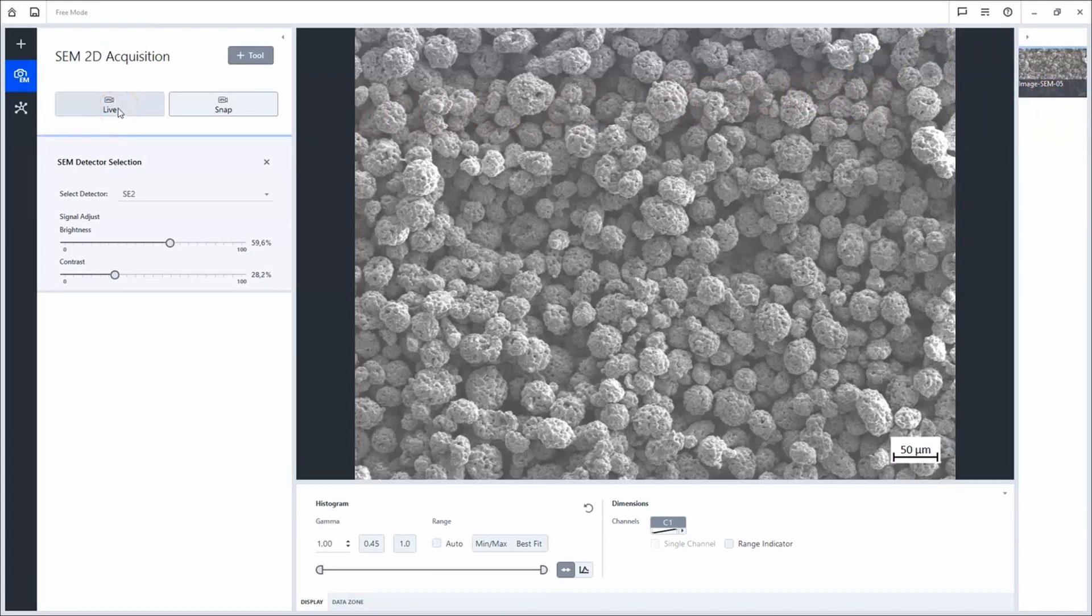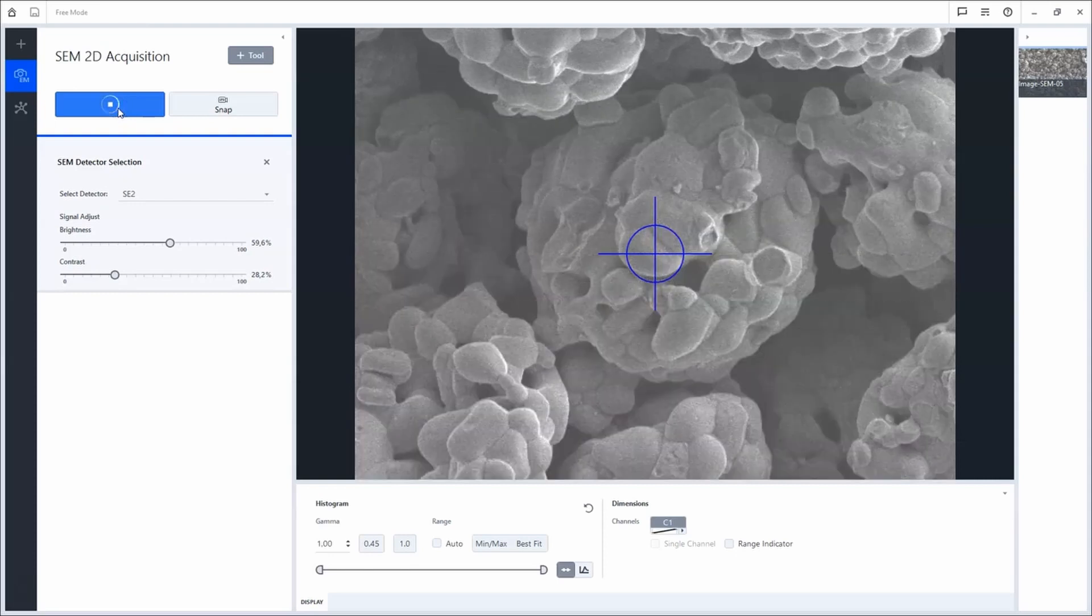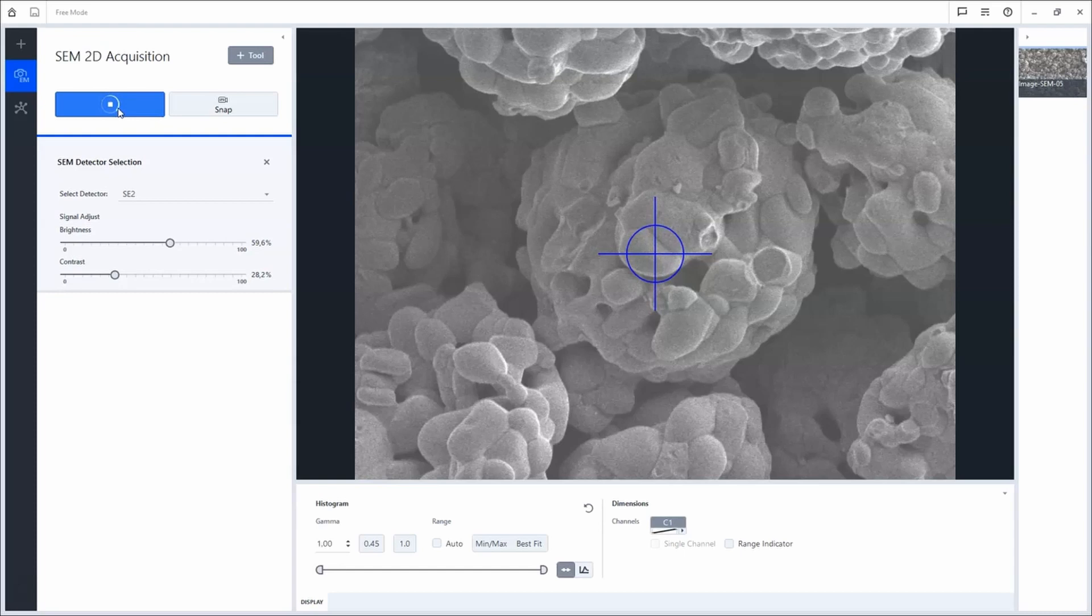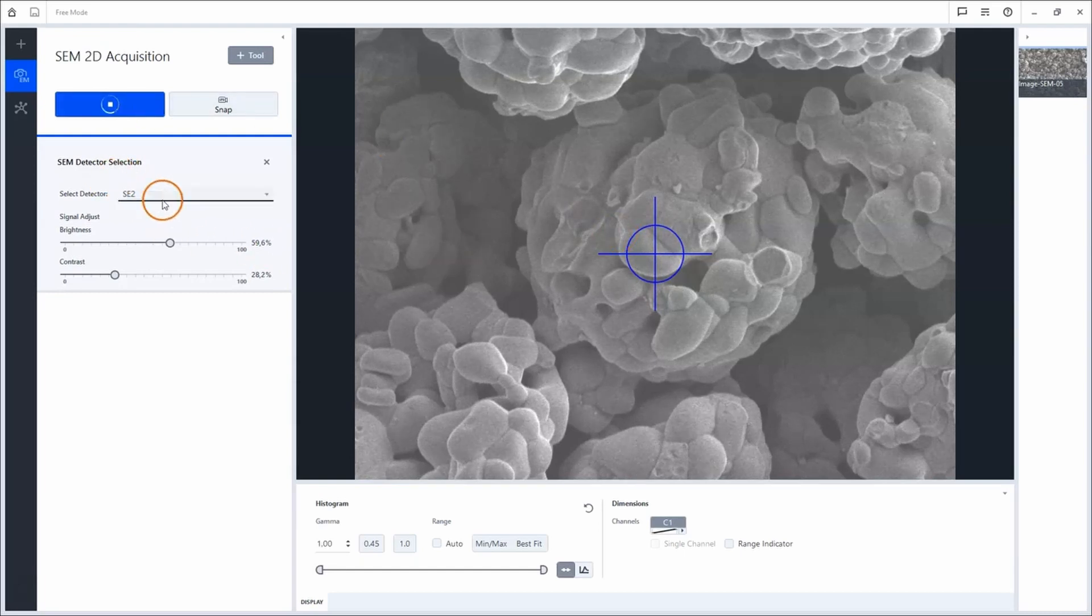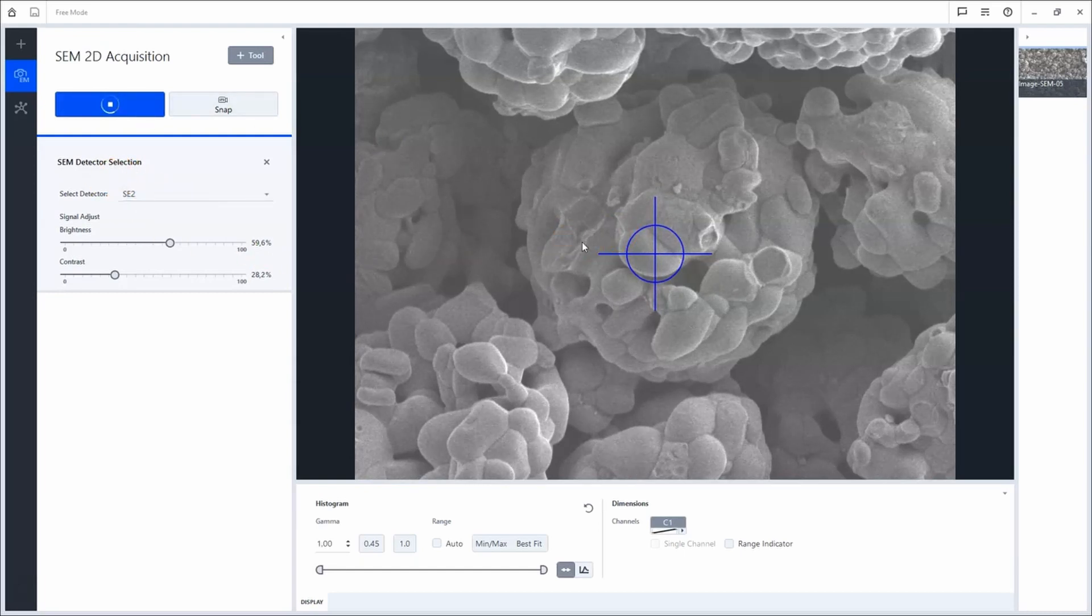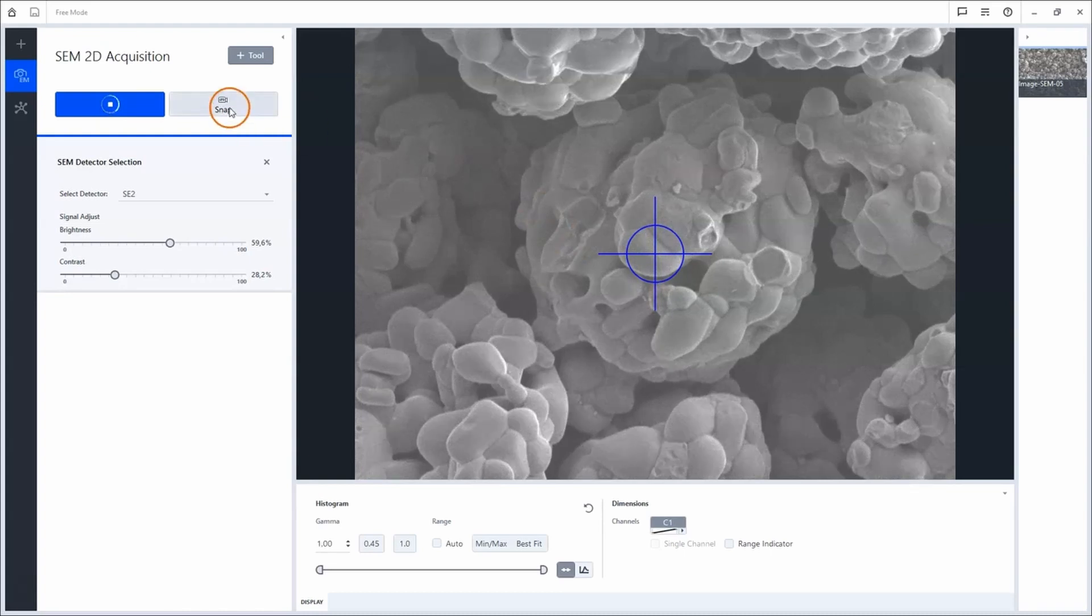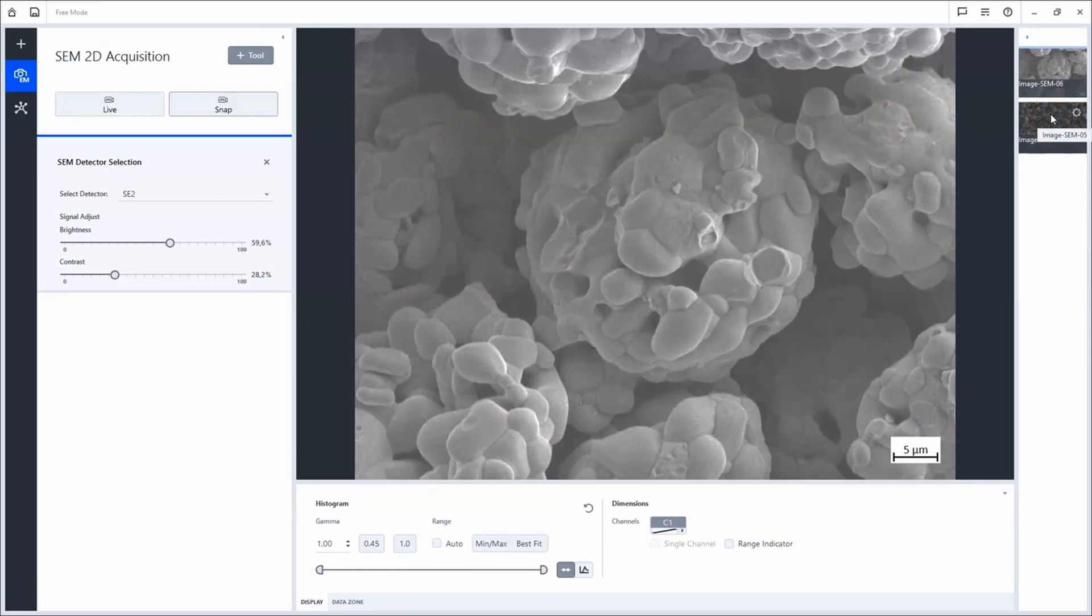I will continue to acquire some detailed images with two different detector signals. First, I will magnify a bit higher and use the secondary electron detector to acquire a topographic image. Click Snap. The image is displayed into the gallery.